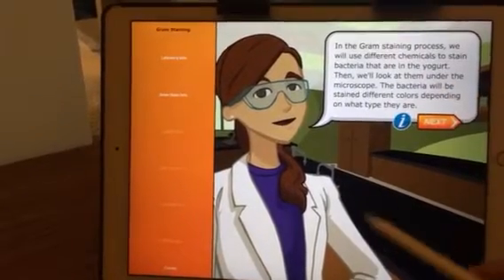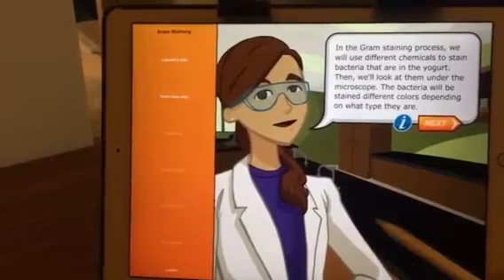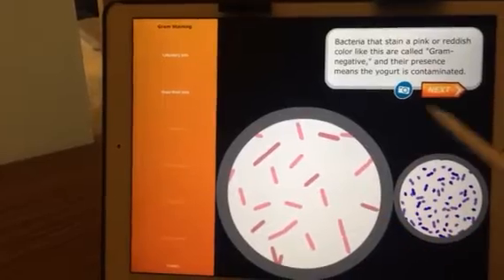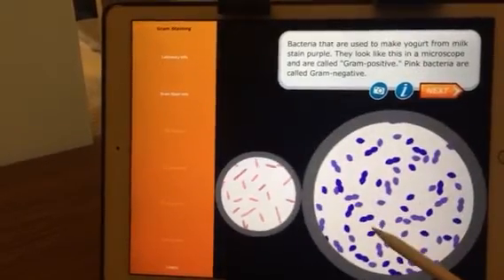Let's collect yogurt samples. In the gram staining process, we will use different chemicals. Bacteria that stain a pink or reddish color like this are called gram negative.